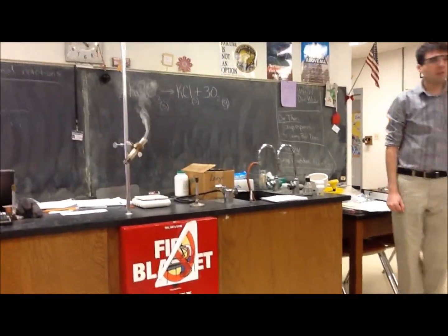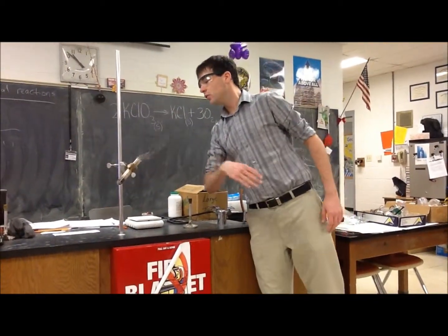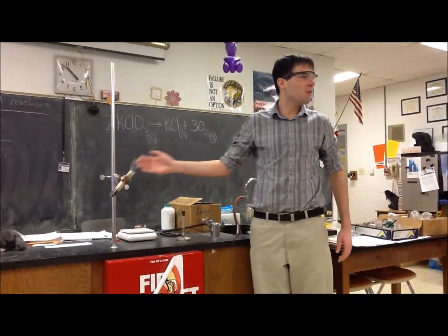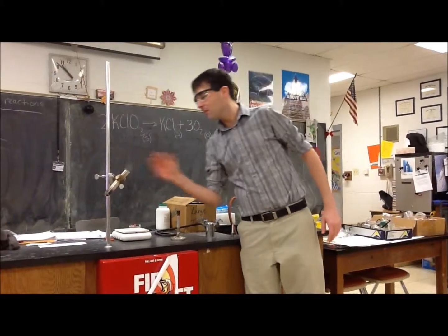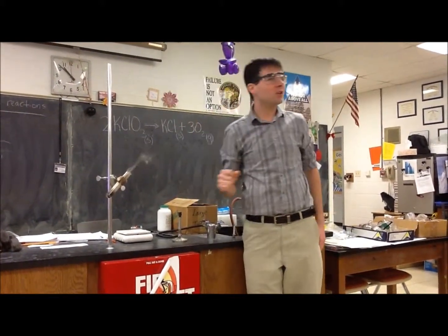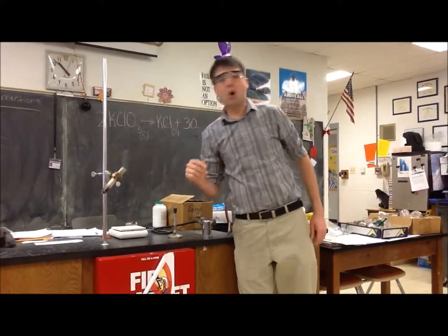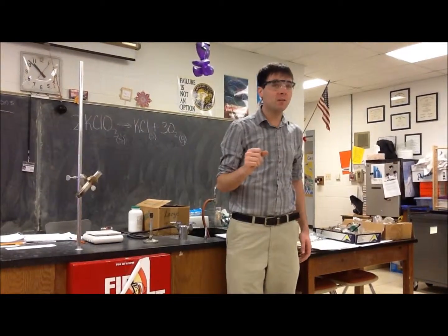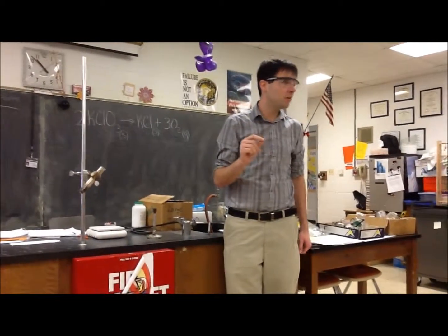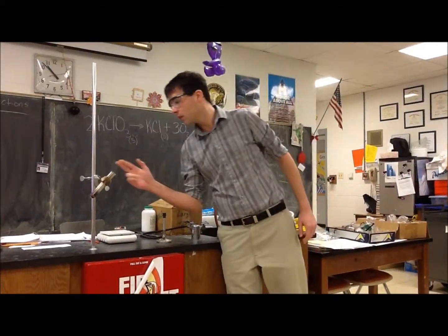Just wait for a minute, and I'm going to come up here. All this gas. It smells like roasted marshmallows. It looks like there's a little bit of gummy bear left. There's a whole bunch of potassium chloride left inside of there. So a little bit of gummy bear, and it looks like all of the potassium chloride is left.